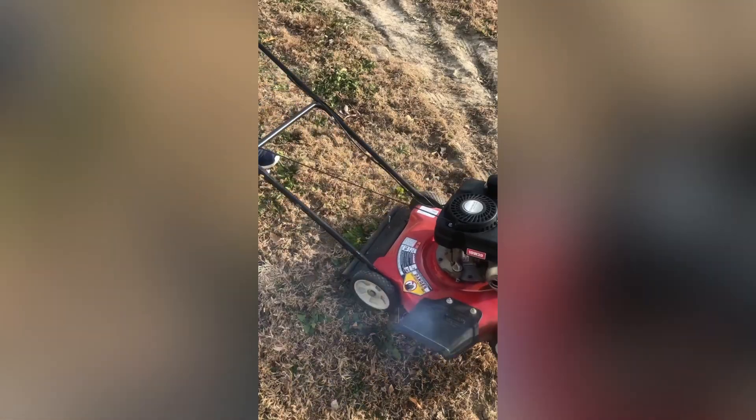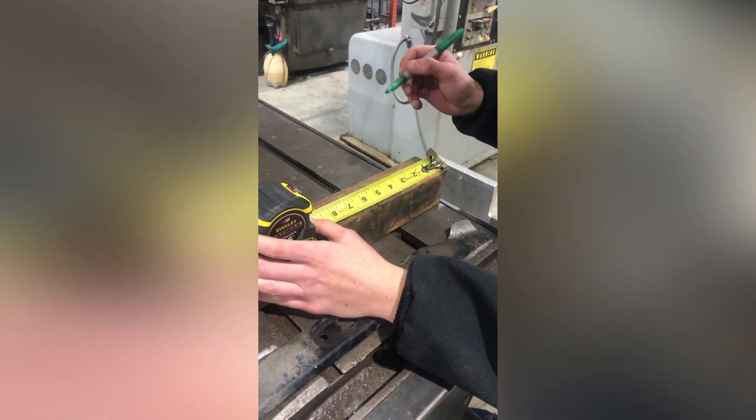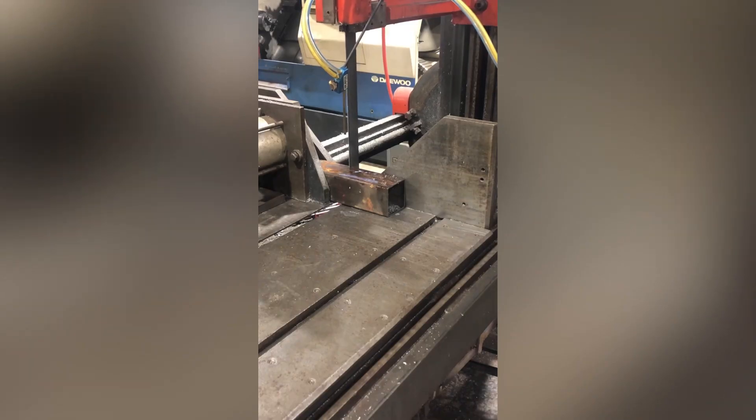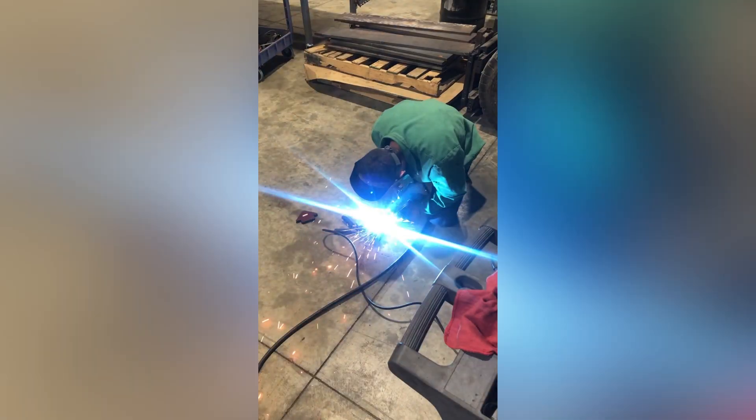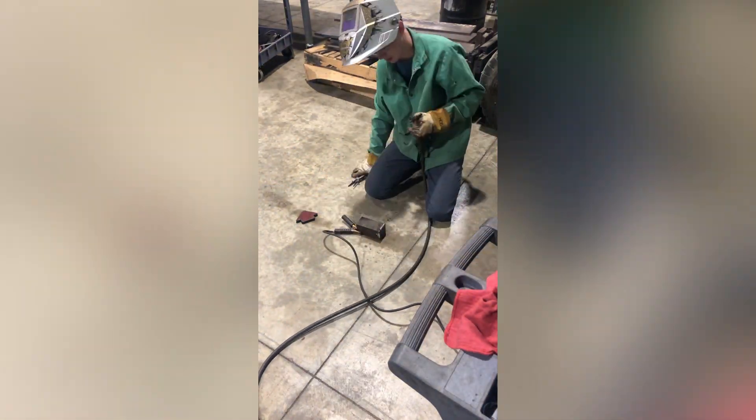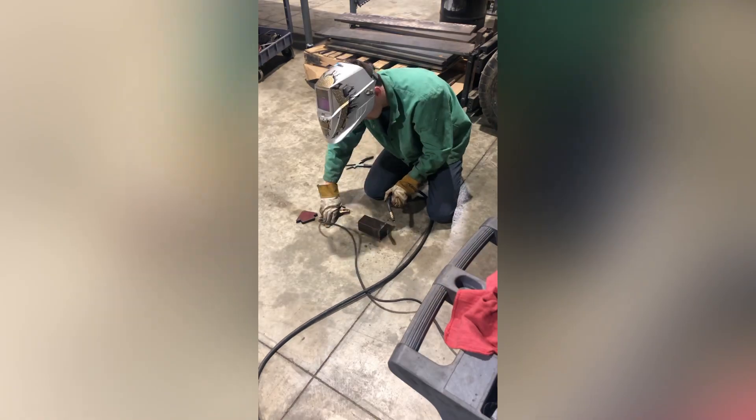I bought this beautiful lawnmower because I had this absolutely crazy idea to turn it into a terrifying centrifuge. I started the process by pulling off the blade — it was on there pretty darn tight. Once the blade was off, I marked out two 5.5 inch pieces of square tubing and cut them with an automatic bandsaw. I then cut out some caps and welded it all together, basically making two cups which I attached to the ends of the blade.